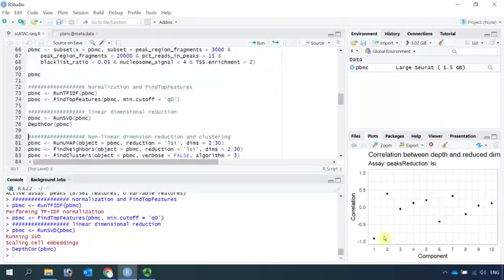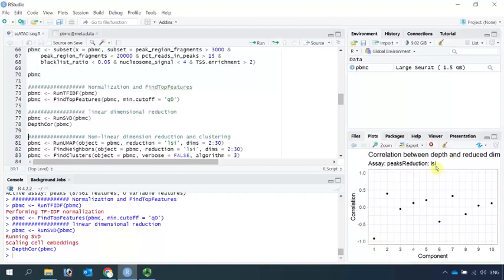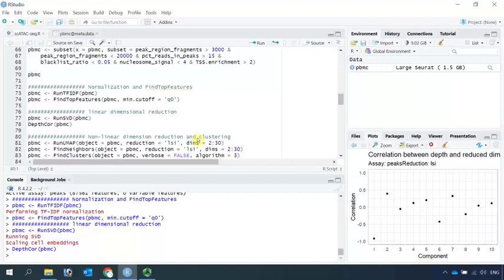You can see from here, the first LSI component has strong correlation with the sequence depth. In the following analysis, we will remove the first component. Now, for the non-linear dimension reduction and cell clustering, the analysis is the same as the single-cell RNA sequencing data analysis.